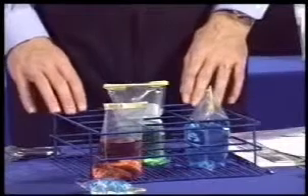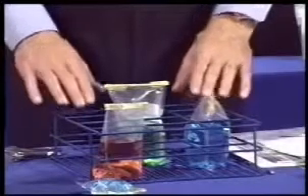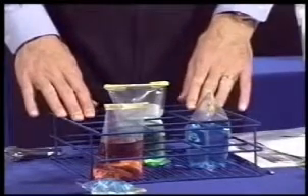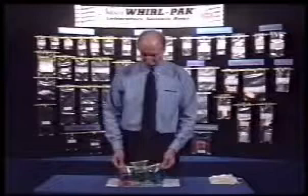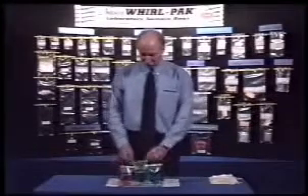Racks are available for all Whirlpack bags. They are made of steel and have an electrostatically applied powder finish. This strong, durable finish will stand up to many laboratory materials and allows the racks to be autoclaved. The racks also serve to hold the bags upright in the laboratory during testing and analysis.